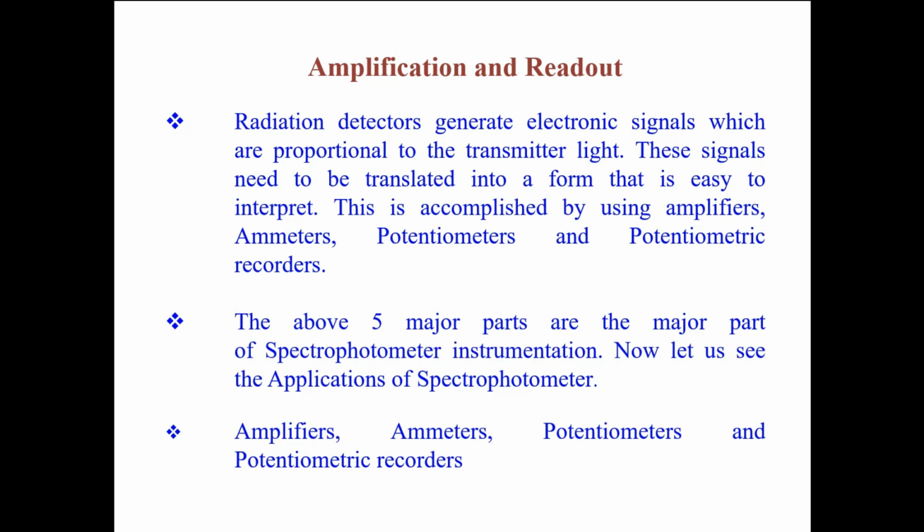So there are three kinds of detector systems available. The first one is the detector system which we call photocells. The photocells are selenium based ones, and this is the first type of detector system, which was identified when the photospectrophotometers were identified. That's why photocells had great importance in the earlier days. But it gave a base for how we can calculate the amount of light absorbed by the sample. Okay, so the optical density can be measured.